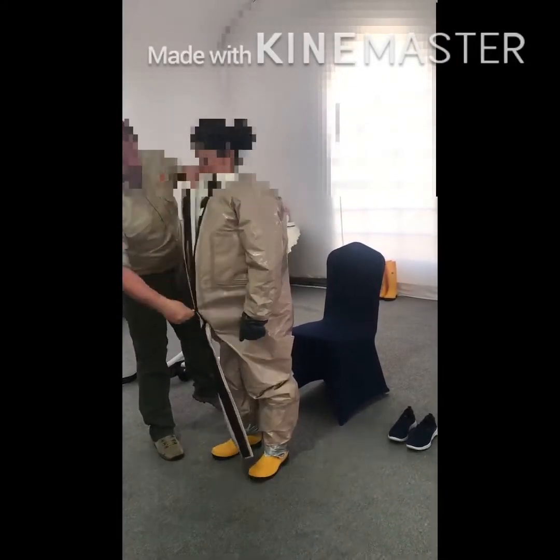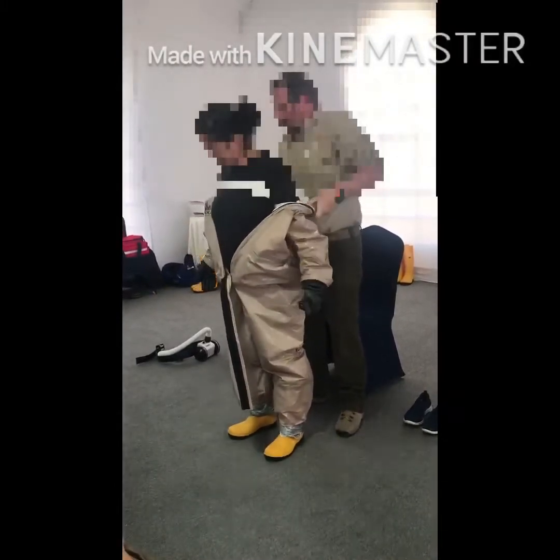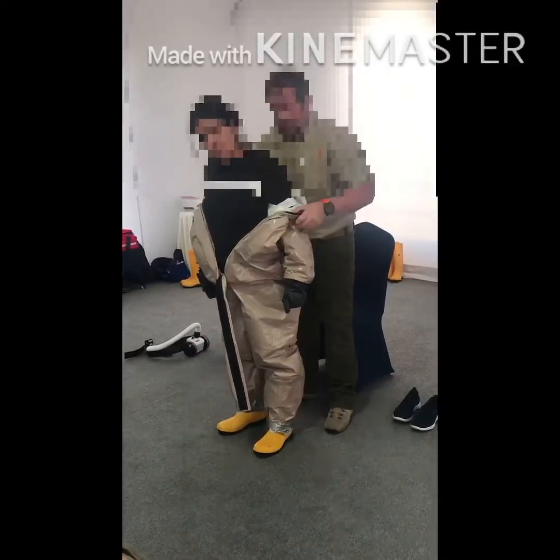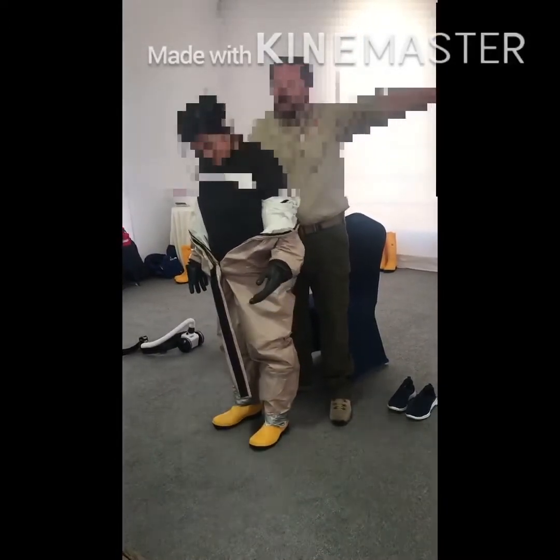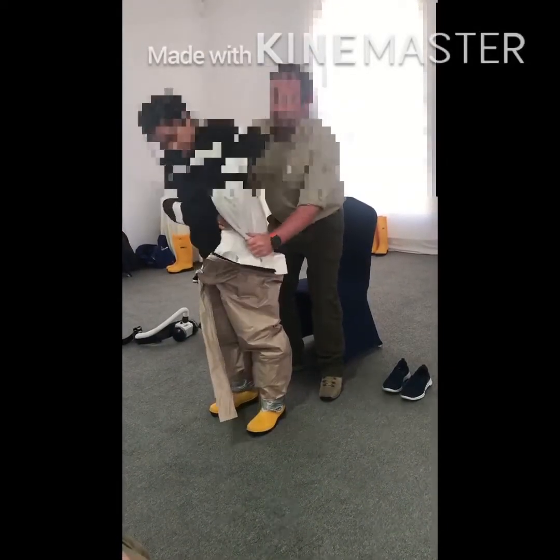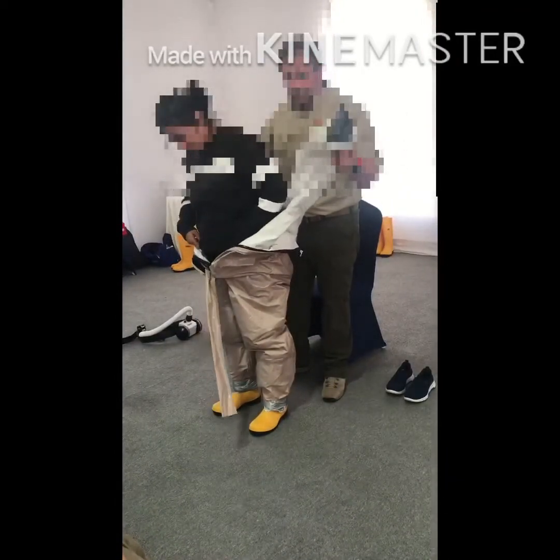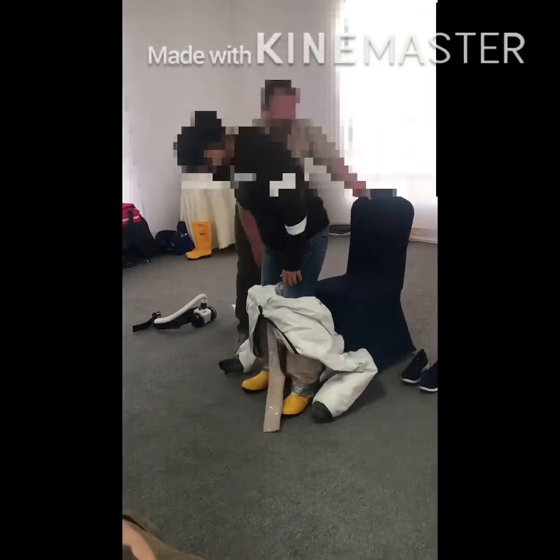Unzip. Then I roll the suit off the body. Don't just pull it off. You are already wearing PPE also. I would be, if I was working in the doffing area. I would probably wear something like the paper suit, a face mask, and gloves. I roll it off the body, so it's always inside out. If I'm wearing normal gloves, the gloves come off with the suit, not separate. Then pull it below her bottom, and then say, please sit down.